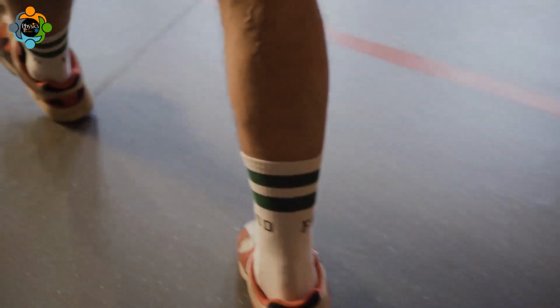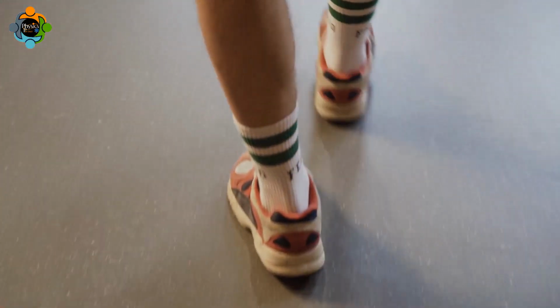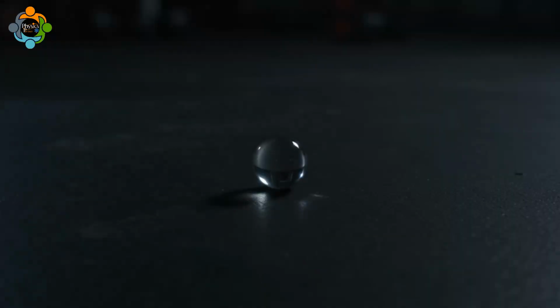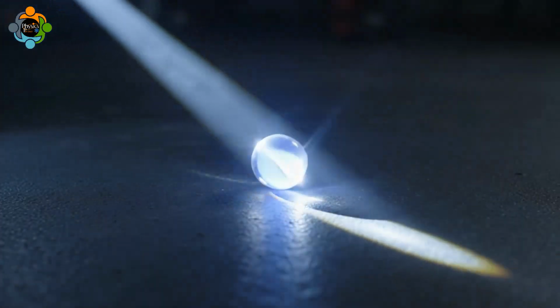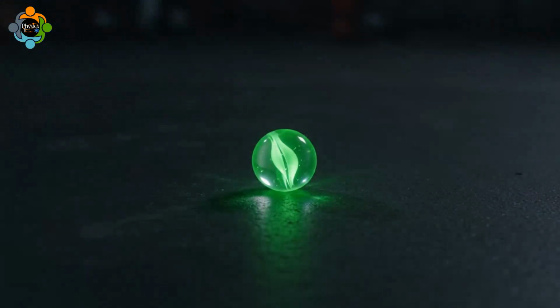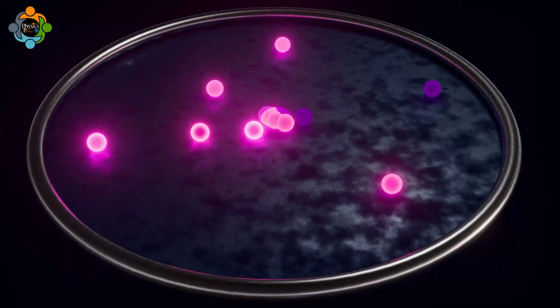Imagine searching for a single clear marble on a dark floor. Nearly impossible. But now imagine that same marble glows bright neon green whenever you shine a light on it. Suddenly, it's not just visible but easy to track. That's the principle of fluorescence.